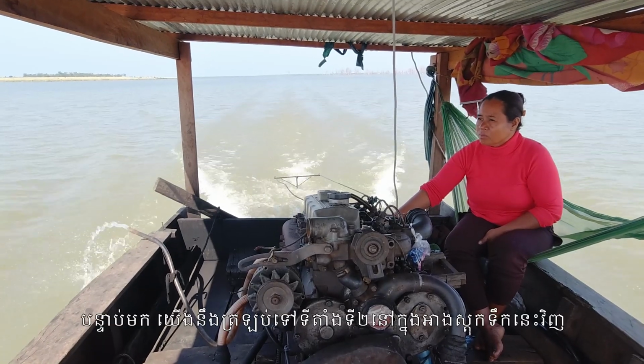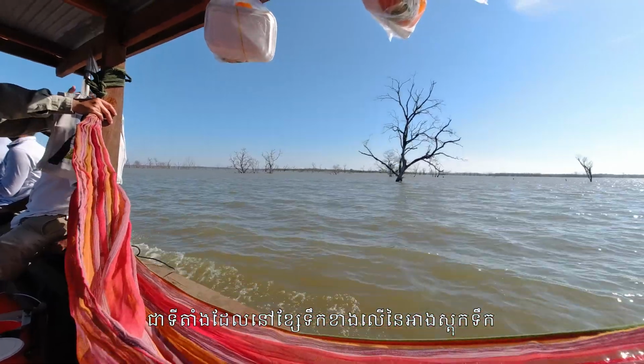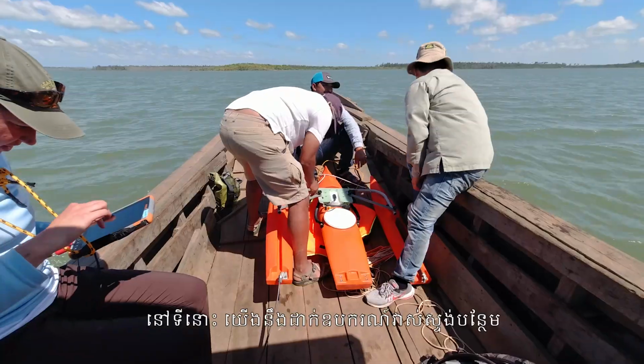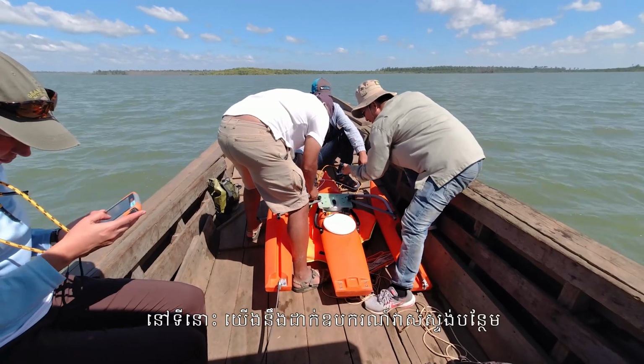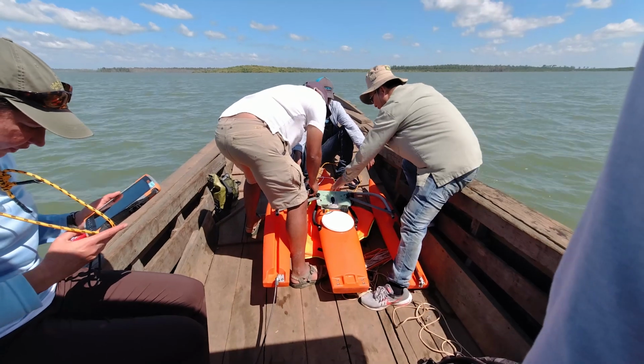And then we're going to come back to the second site on the reservoir, and that's a site that's further upstream on the reservoir where the river inputs into the reservoir. And there we'll also put more sensors that we'll deploy into the water to measure water quality changes.